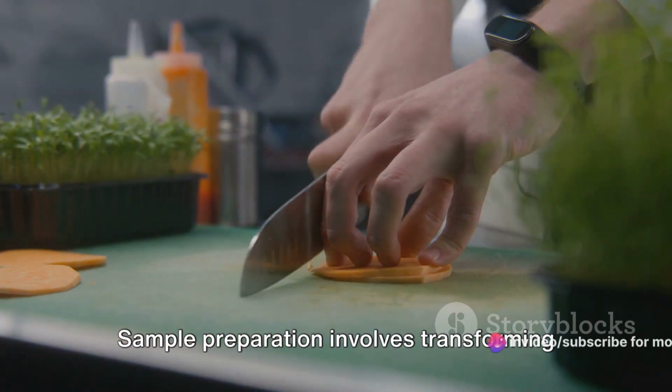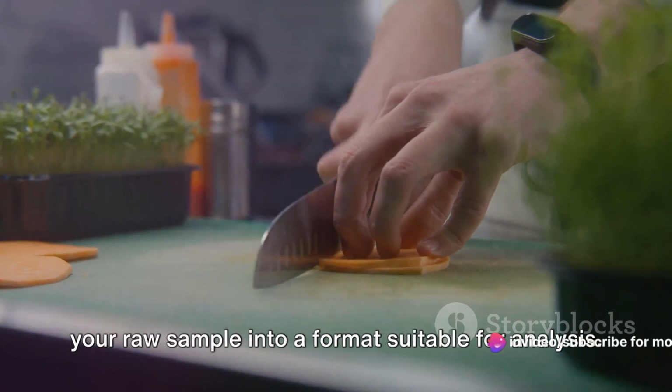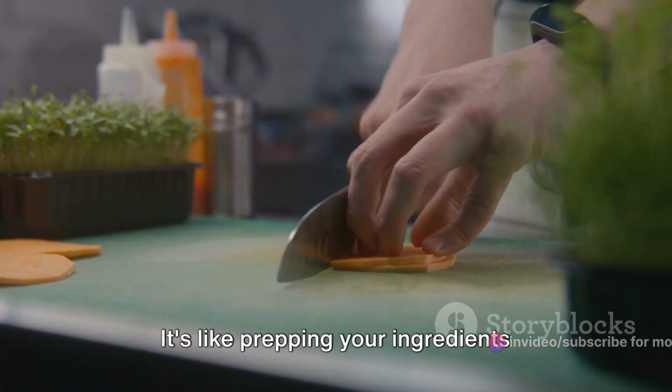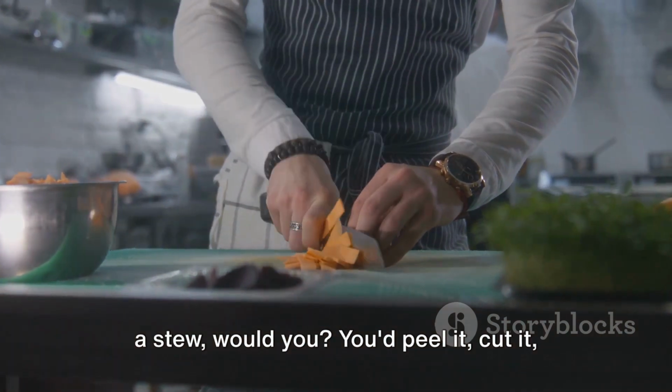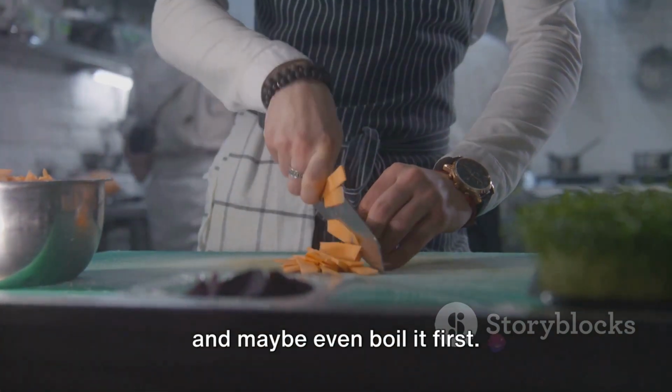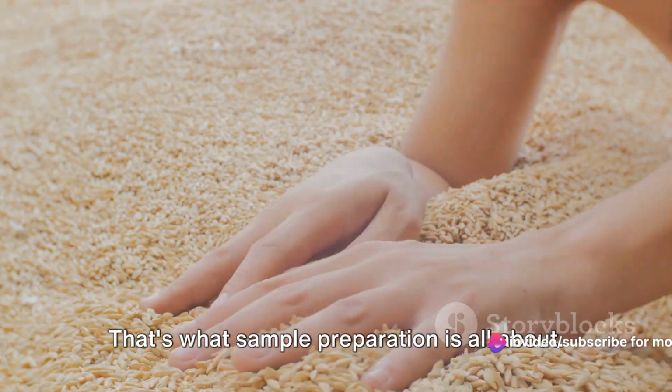Sample preparation involves transforming your raw sample into a format suitable for analysis. It's like prepping your ingredients before cooking. You wouldn't throw an entire potato into a stew, would you? You'd peel it, cut it, and maybe even boil it first. That's what sample preparation is all about.